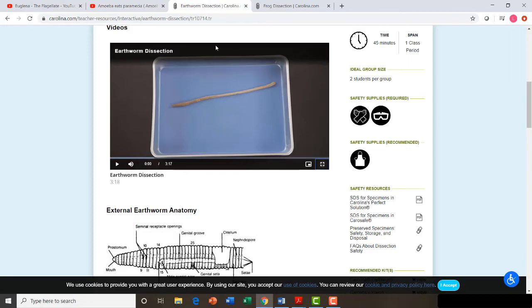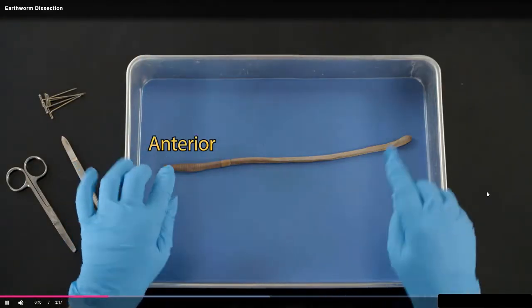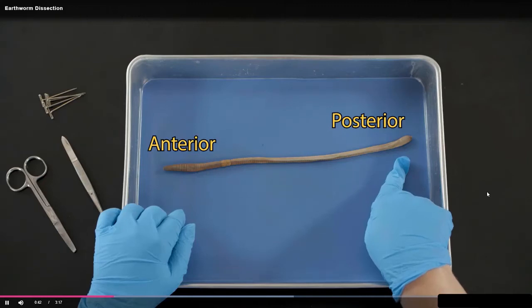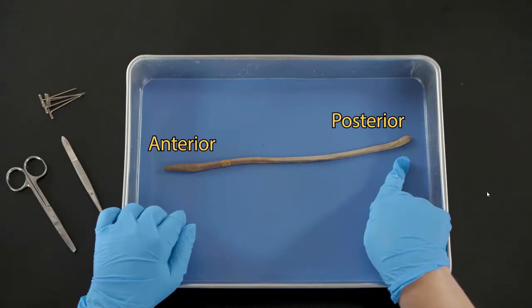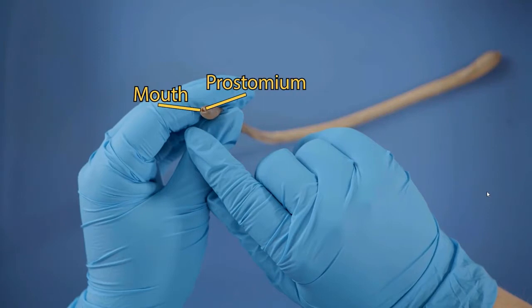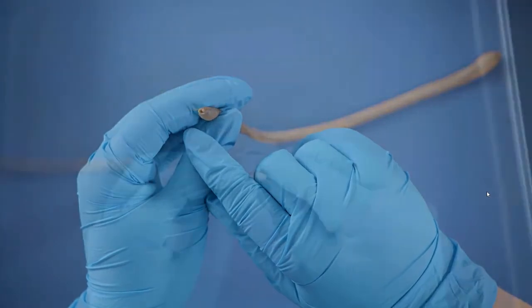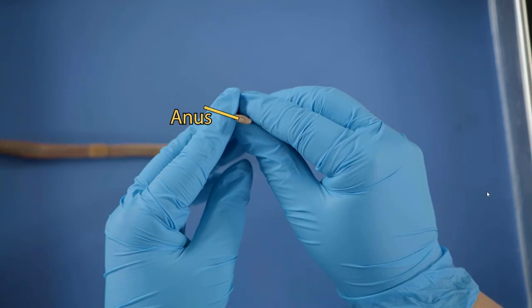This is from Carolina. Identify the anterior and posterior end of the earthworm. Notice the anterior end is slightly larger than the posterior end. At the anterior end, locate the mouth and prostomium. At the opposite posterior end, locate the anus.